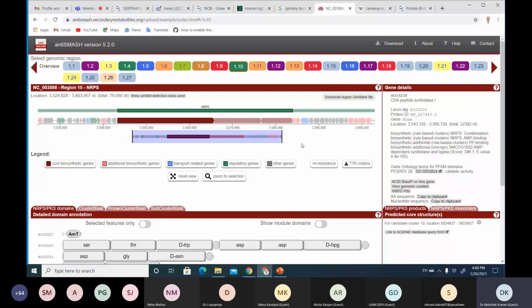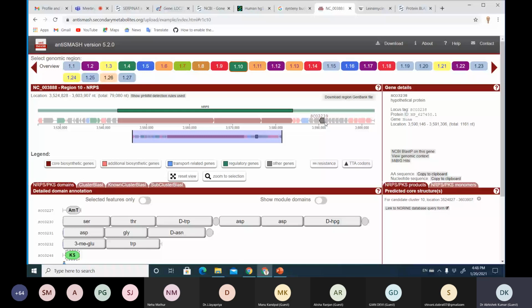It's easy for me to tell you, look here, look here, look here, but one needs to pinpoint what is happening here. Why are so many genes required in the cluster, and what are they doing? You need to get hints of it, and it's not easy. It requires time. So basically, it's combinatorial. This large cluster works together like an operon. In bacteria definitely it is an operon, but in eukaryotes also it serves as an operon.